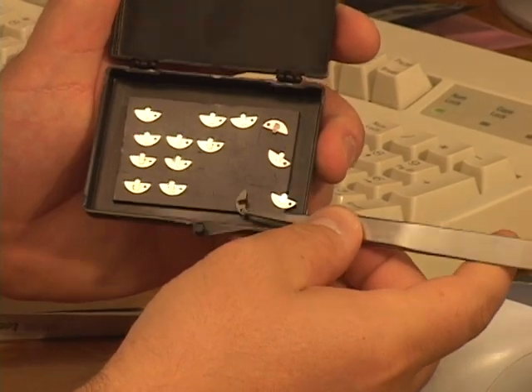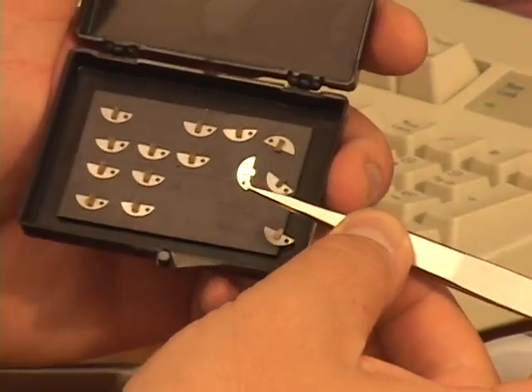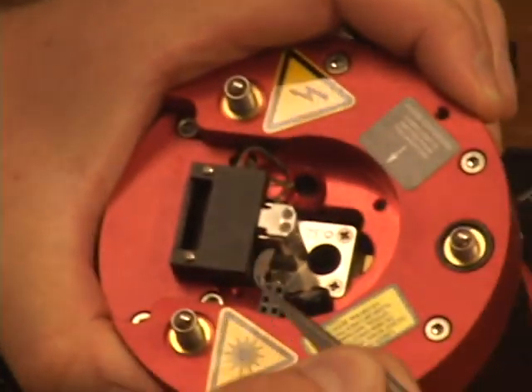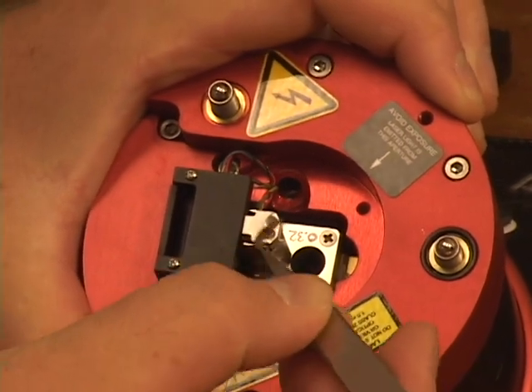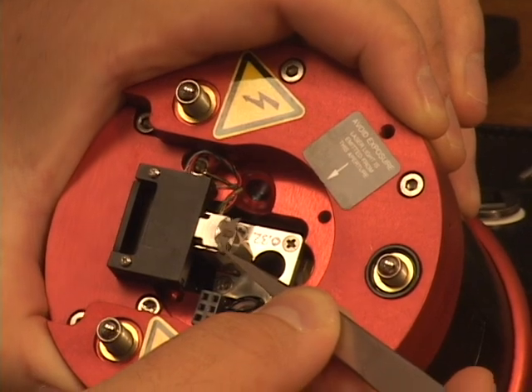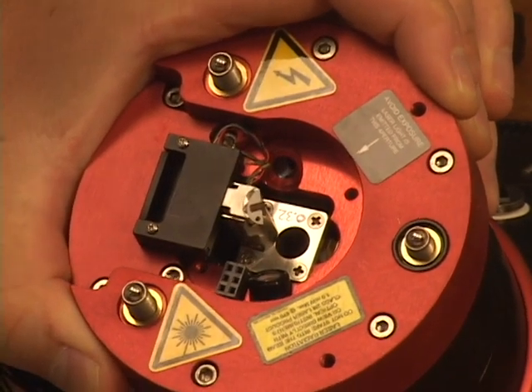So once you grab it from the edge like that, bring it over to the head. The 2 magnets on the Z scanner here will grab onto the half moon pucks, and then let go of it.